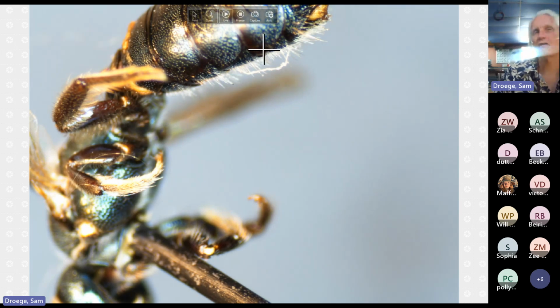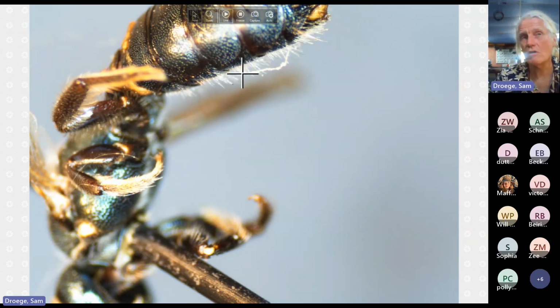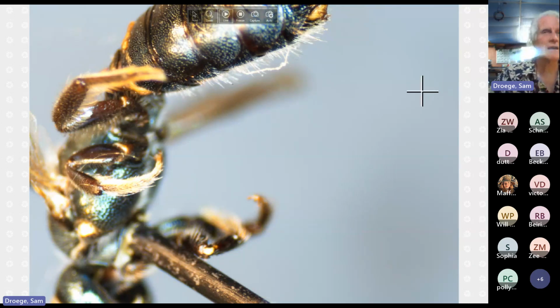They fade into the color pattern. So you're going to want to look at a lateral view, across the sternal bow, so to speak. And this is a big piece of fiber, so you can ignore that. But that's representative of the kind of thing you're going to see in calcarata.